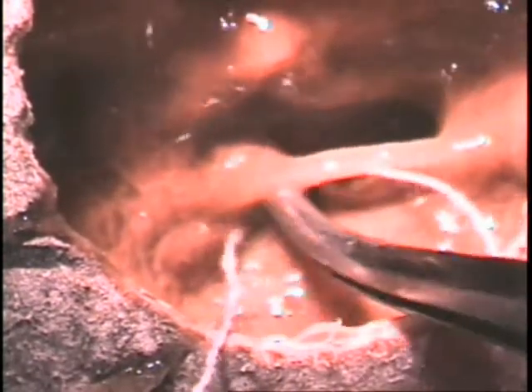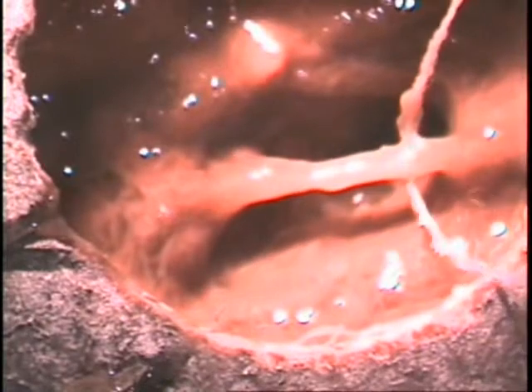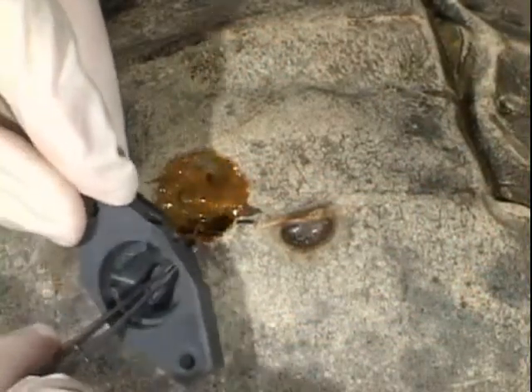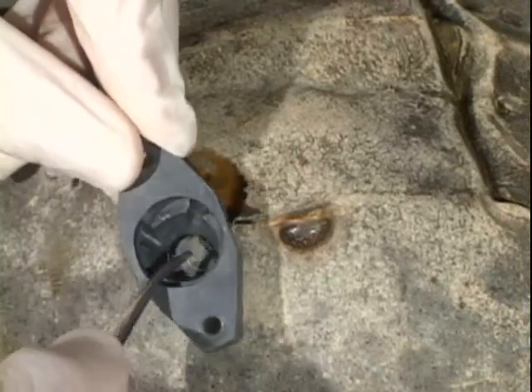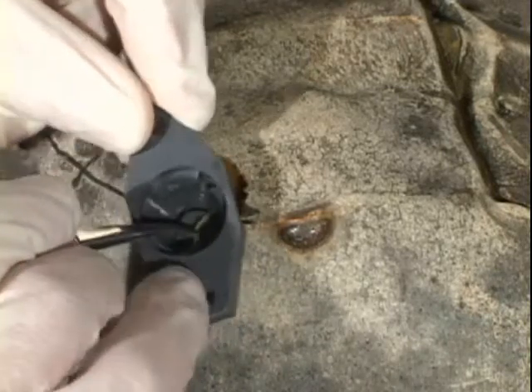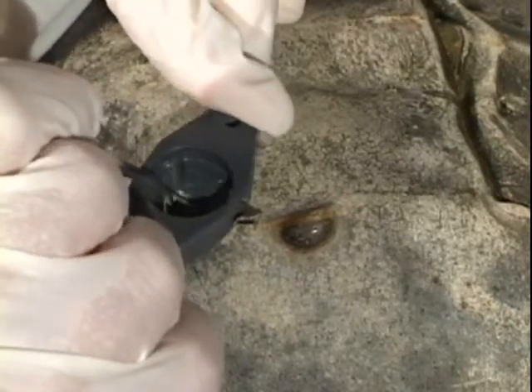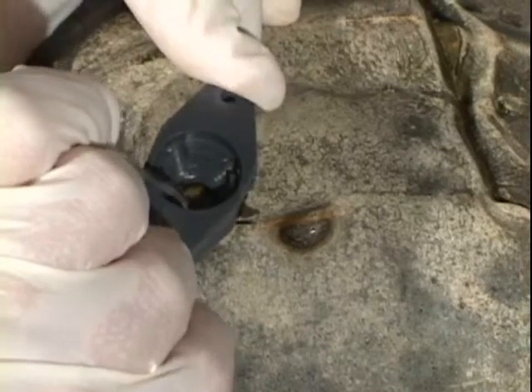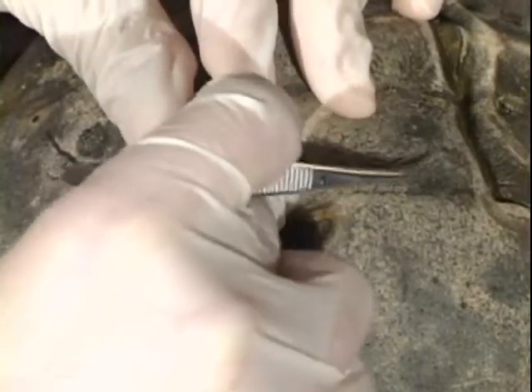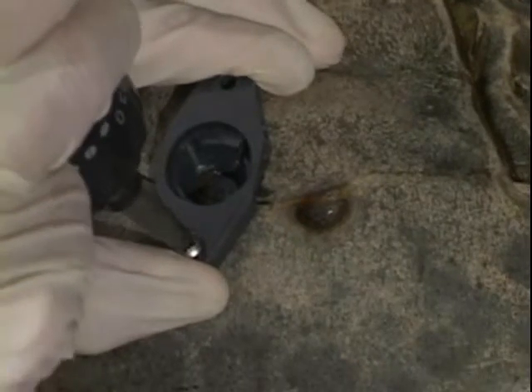A strand of thread is looped around the nerve and pulled into the chamber through the semicircular opening in the bottom. Through this same opening, the nerve is gently guided into the chamber by pulling on the string. As the nerve enters, the chamber bottom is pushed into the hole so as to minimize stretch on the nerve. The chamber is then affixed with two screws and filled with ringer solution.